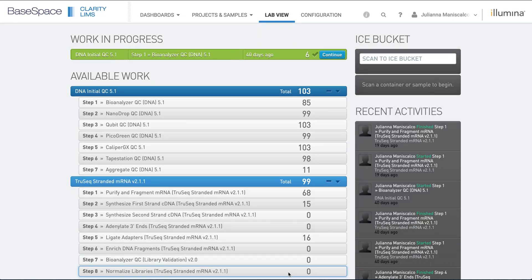In this video we are going to review one of the three ways to accession samples into Clarity LIMS. This video will demonstrate how to use an Excel template to batch upload samples into a project.